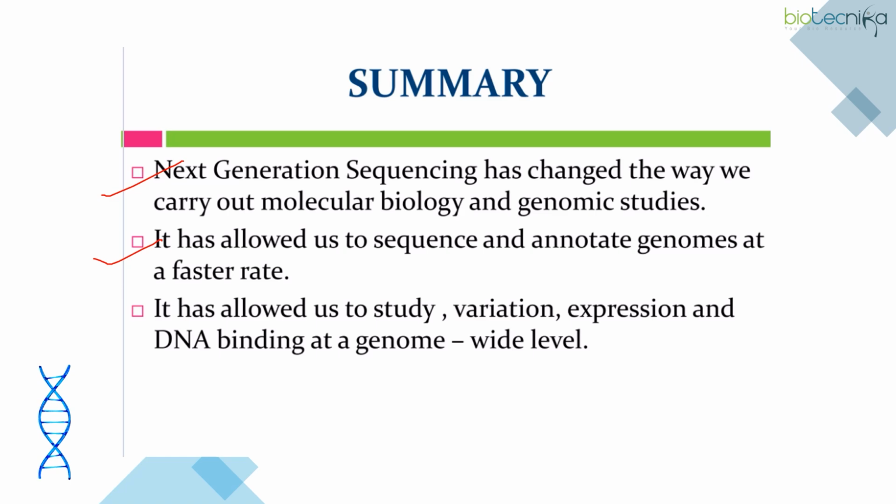Because we have standard pipelines and databases on bioinformatics platforms that will help you process your FASTQ file to identify the variant calling files accordingly, right? It will also allow us to study variations, expression patterns, and even DNA binding at the genome-wide level. Okay, so that is a quick summary.